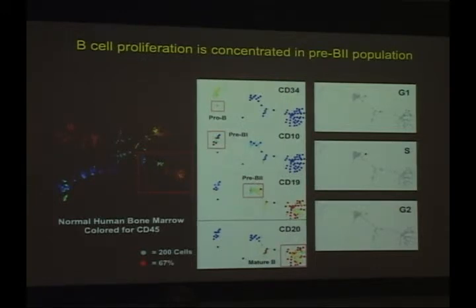In the supplemental information, there's a table that describes why we called everything what we called it. Mostly that's immunophenotypic information, but some of it was signaling state. Some of it's just that this population here is clearly this and this population here is clearly that. The only thing in between is exactly what we'd expect to be in between, but we didn't really have a great marker for it, but everything that we did have was consistent with that, and so that's our best guess.